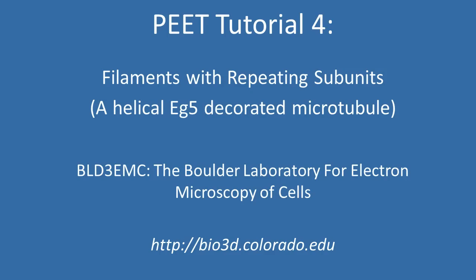Specifically, we'll look at a 15-protofilament helical microtubule which has been decorated with kinesin-5 motor domains.